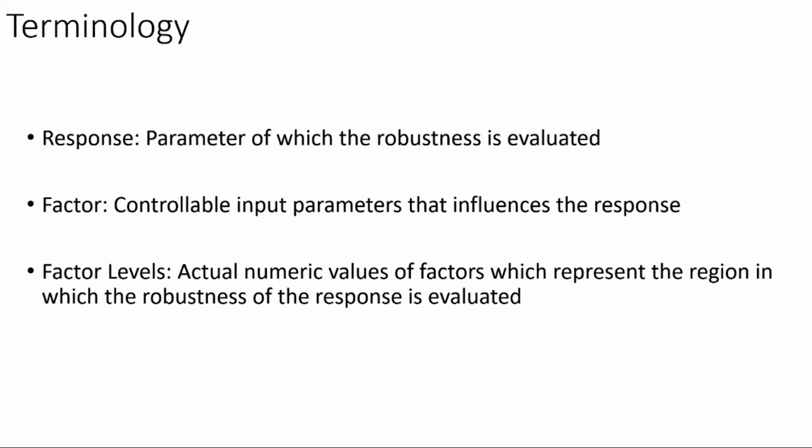We need to understand that there is a response. The response is a parameter of which the robustness is evaluated. Sometimes it's also known as the response variable, and in our case it's going to be the retention time.